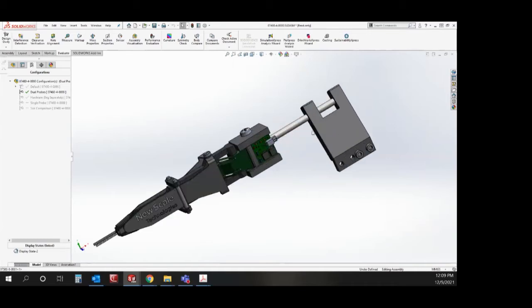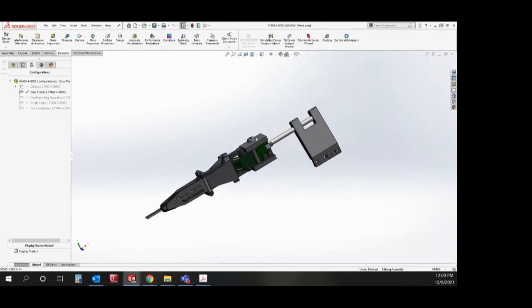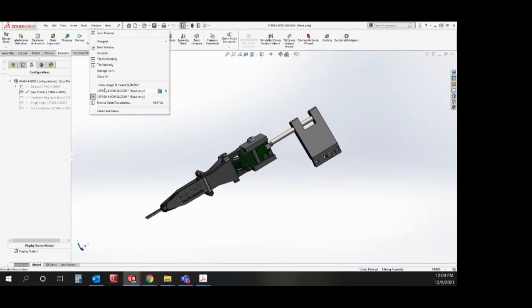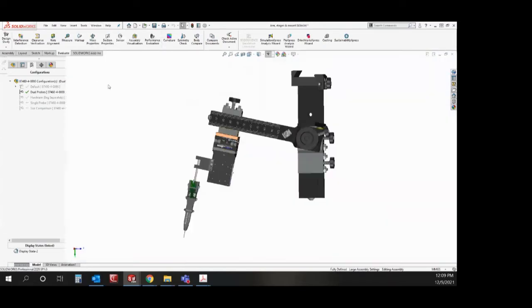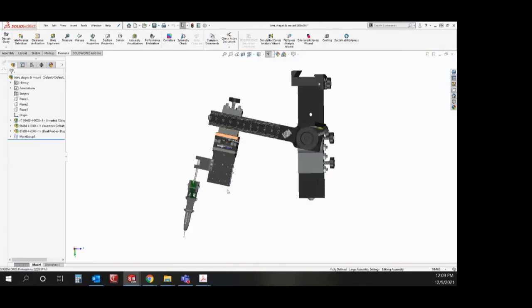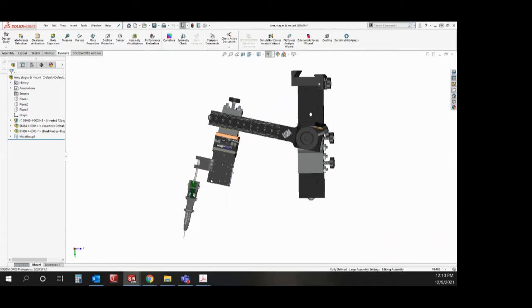This probe mount is compatible with our MPM system. It can be mounted onto our M3 LS 3.4 stages like this. Some of you may be users of our 1A slim probe mount that's normally mounted up here, but we remove the probe mount bracket and we install the probe directly onto the stage towards the back of the carriage here.